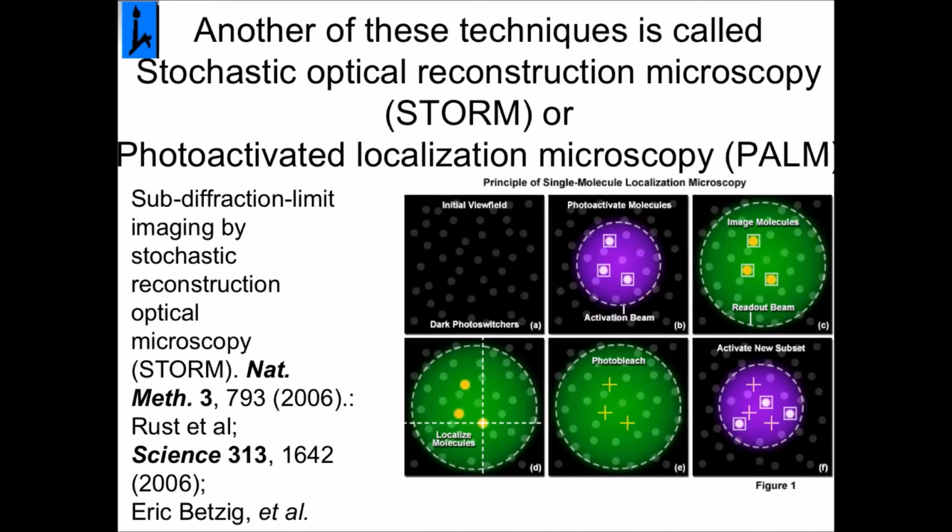So Shechtman is working on it in MDM, no? No, he's working on point spread function, trying to analyze the 3D point spread function. Remember, I told you that in Z, the depth is very large.